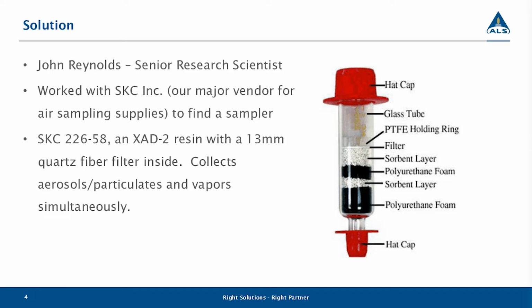So not only was this meant to have a wide applicability, it was also meant to be able to handle a decent amount of air volume, as a lot of pesticides have really low exposure level requirements. And we can go back and talk about more specifics about this sampler at the end if you have specific questions, but I wanted to give you a brief picture. This picture just comes directly from the manufacturer SKC's website, and information about this sampler can be found on their website.